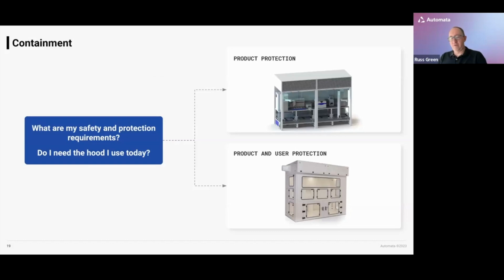So, containment. I've spoken a reasonable amount about this already, but I want to come back to it. What implication does it actually have once I've thought about what my needs are for containment? What does that actually mean to us from an automation design perspective? I just wanted to show two examples here. If we do need just product protection, we can continue to design quite open and user-friendly systems that also help to drive adoption, because now I've got an open system with lots of these devices accessible and walk-up, because all I need to do is blow HEPA-filtered clean air over that system at a particular rate. If I need product and user protection, this is very doable.